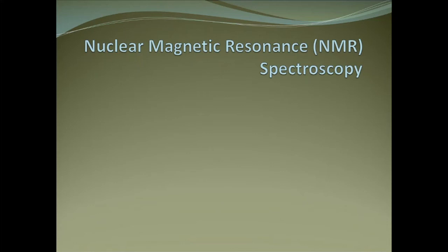The topic of today's video is the analysis and the report for the alkyl bromide synthesis, nucleophilic substitution of an alcohol to synthesize an alkyl bromide. One of the methods that you will be using for the analysis is nuclear magnetic resonance spectroscopy. You've seen this before, but we'll go ahead and give a recap of that.